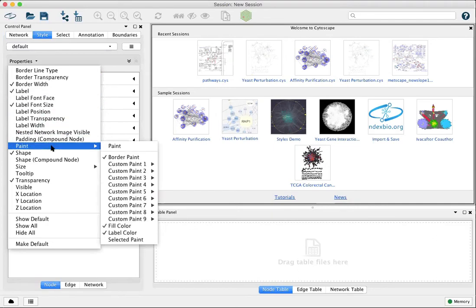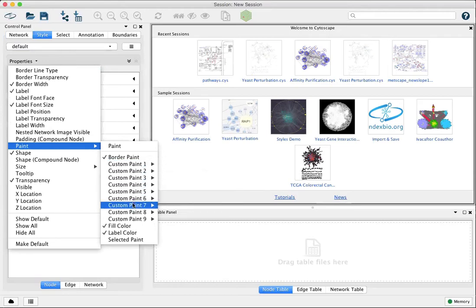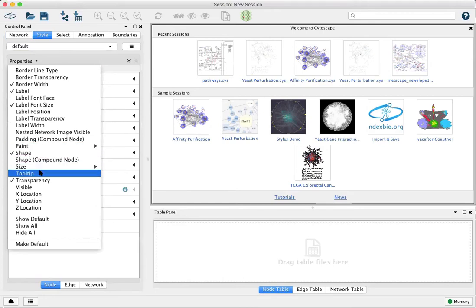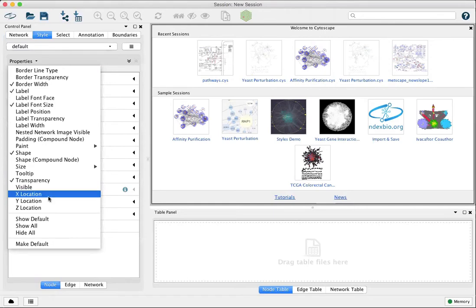Under paint you can also find additional image chart settings for custom graphics. You can add tooltips to nodes and you can even specify x and y locations for each node.